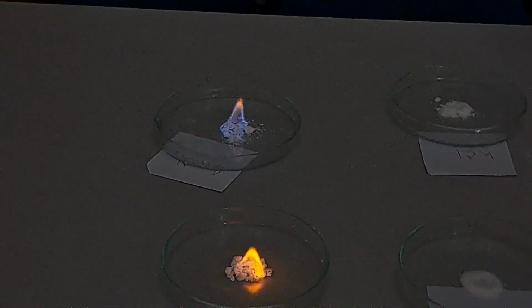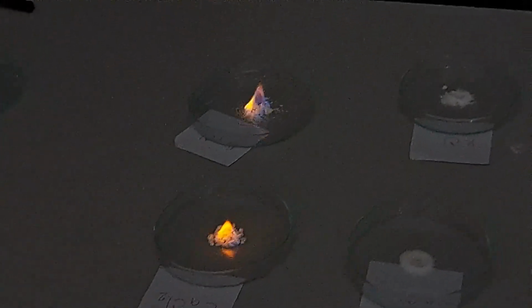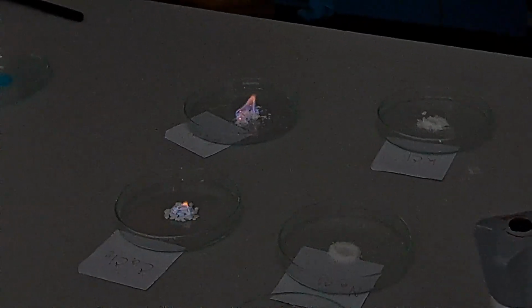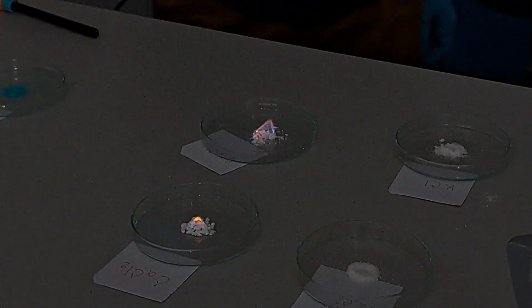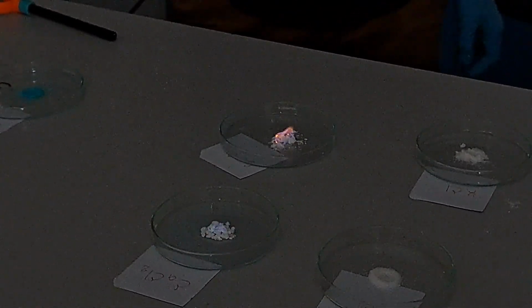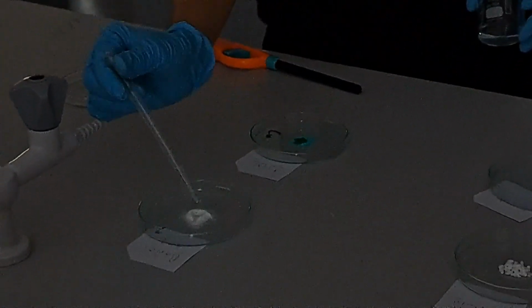What is it? There's a flash. So why does this one have blue? Is blue faster, from the ethanol? Yeah, but you'd better observe the color that flashes off sometimes. Alright, let's do these two together because they are very fancy.